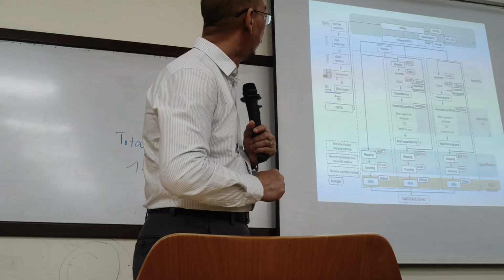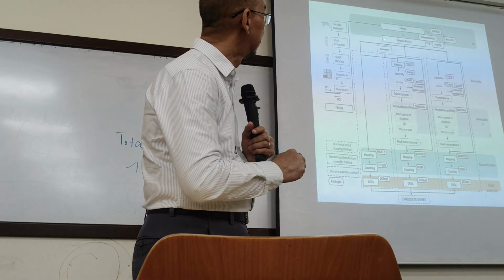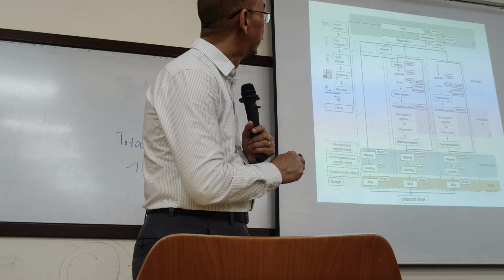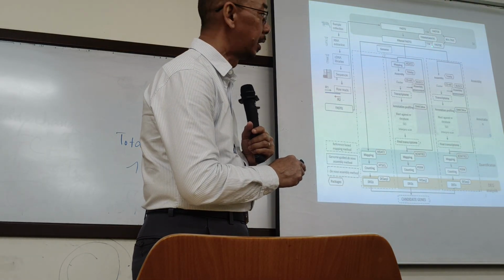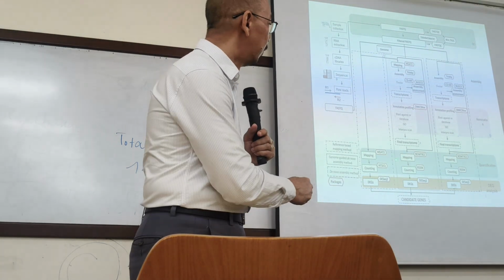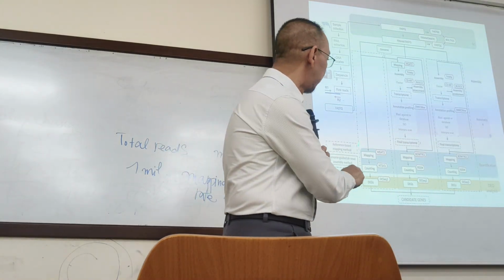Here we finish sequencing and then apply the program FastQC to check the quality. We apply more methods to remove poor quality reads and then continue. You ignore this one, we go to the second and third column. I will explain this one later.